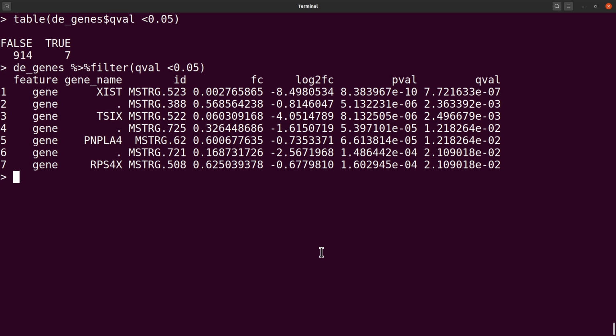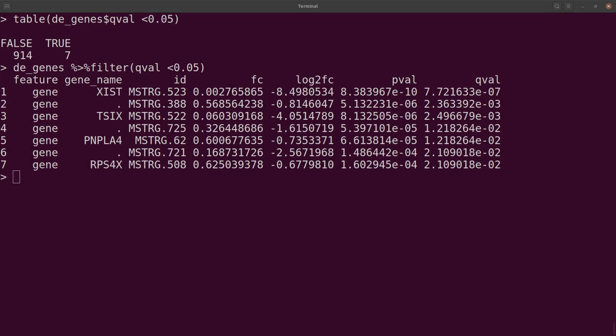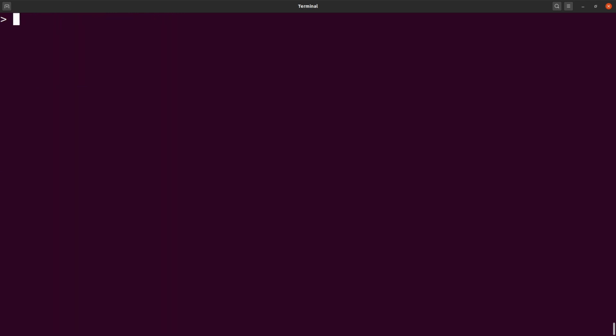So we are going to have 2 tables. Let's start with the transcripts. Let me just check again. Perfect. So with the transcripts, let me just clear the screen and continue.